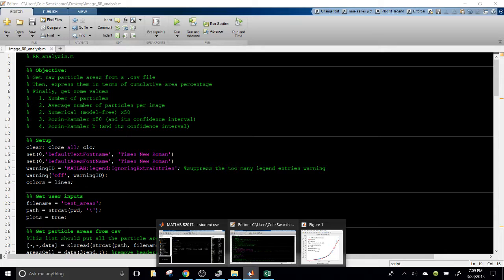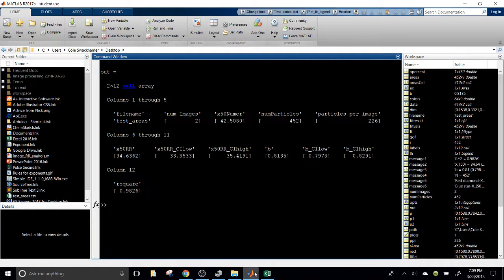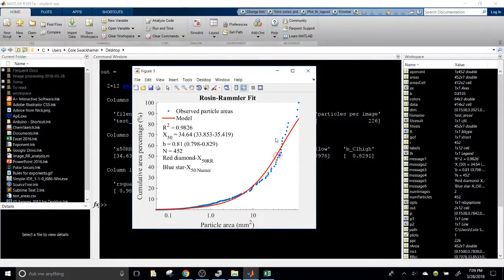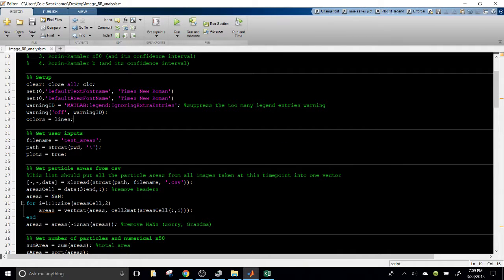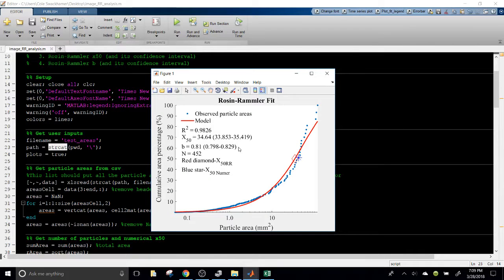It's compiling it into something that's easier for your machine to read, and the result is the first time it builds that more basic code, so it takes longer to run. It also puts functions on kind of a short list, things like strcat or whatever. Okay, so that's a little bit of MATLAB for you.